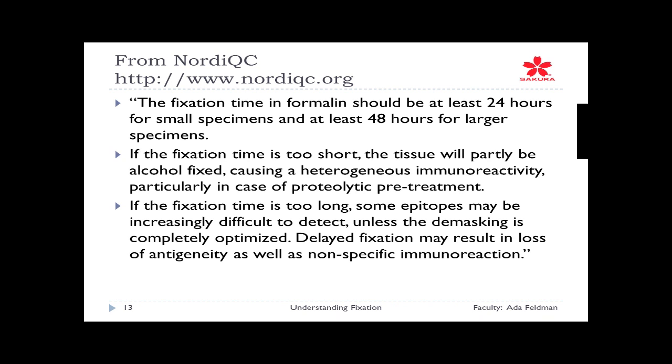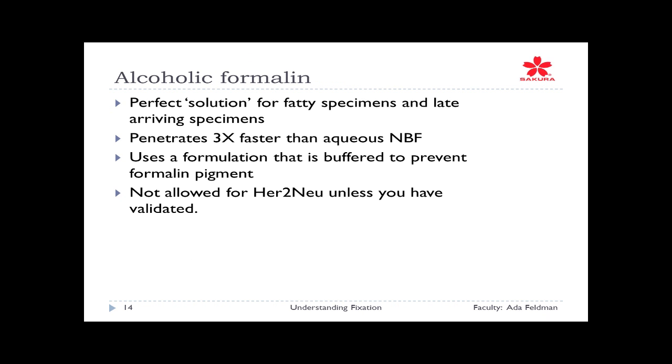So as you can see, everyone is saying you've got to give time to the specimens. And let's admit it, time is the one thing you don't have anymore. Get the specimen in, get it out, all right? Because there's somebody out there competing with you that can give the doctor the results fast, okay? So are there any tricks with formalin?